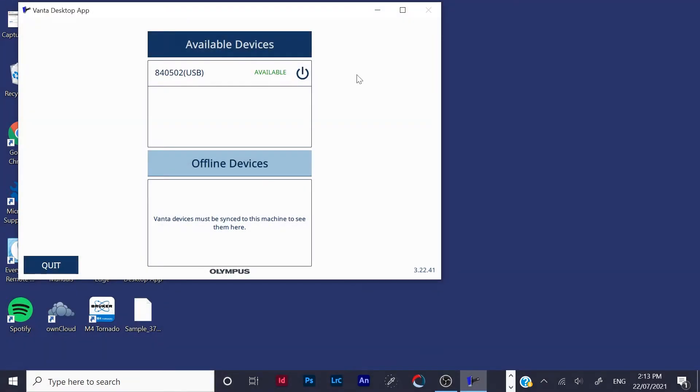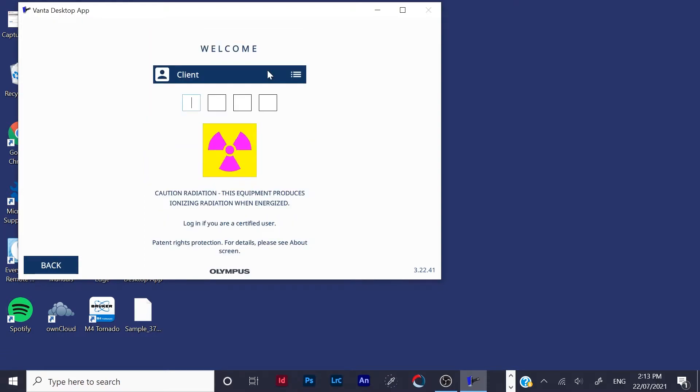So basically, once you open the software, you have to look up here in the available devices for the instrument serial number to come up, which is there. And it is located on the side of the instrument. You click that and type in the passcode.